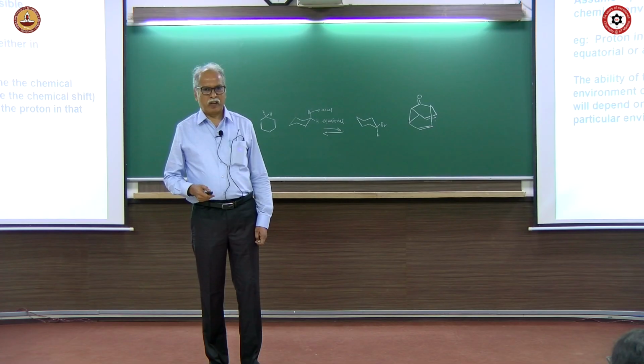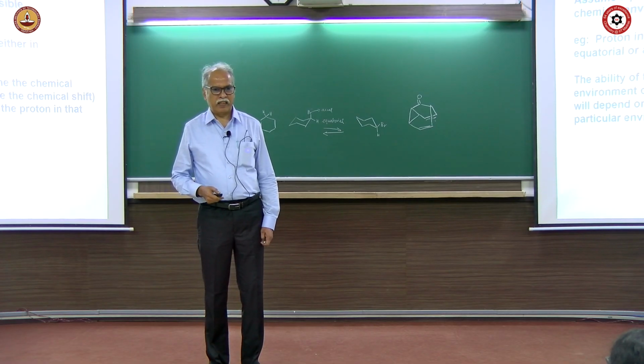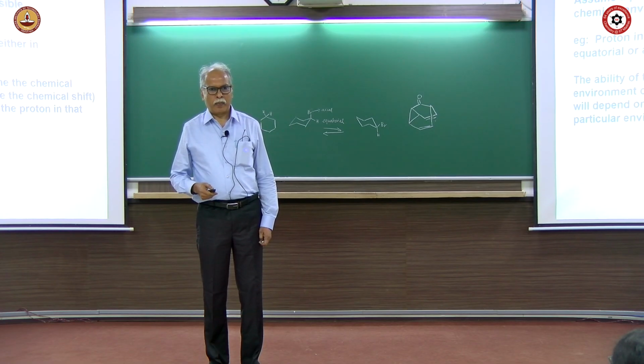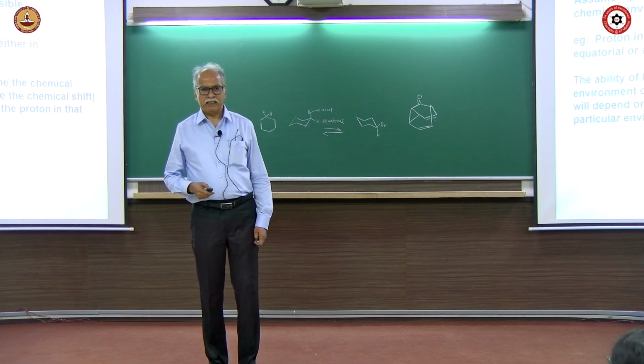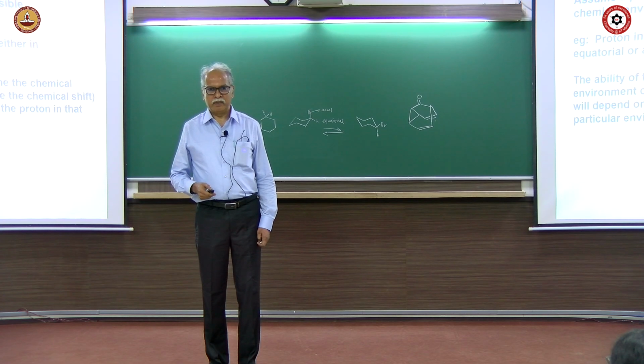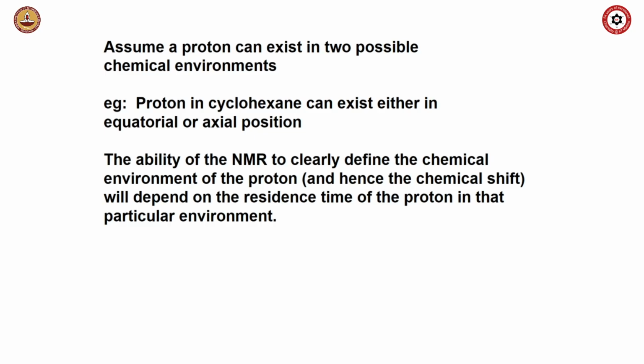When I is equal to half, it can take two positions. One is aligned with the external magnetic field. The other one is opposed to the external magnetic field. And that gives a transition, which is a Zeeman splitting transition. And the transition is what is seen as an NMR spectrum, giving a line in the absorption scale.